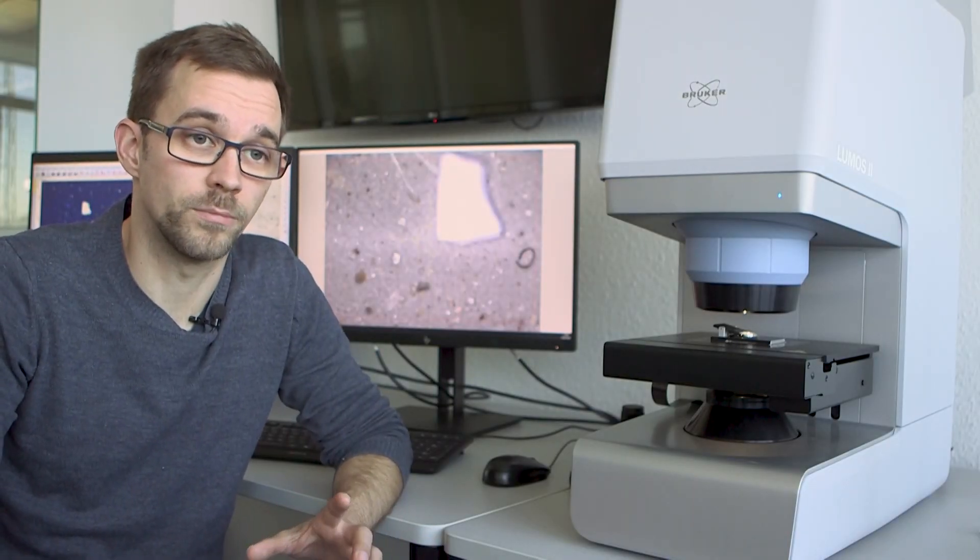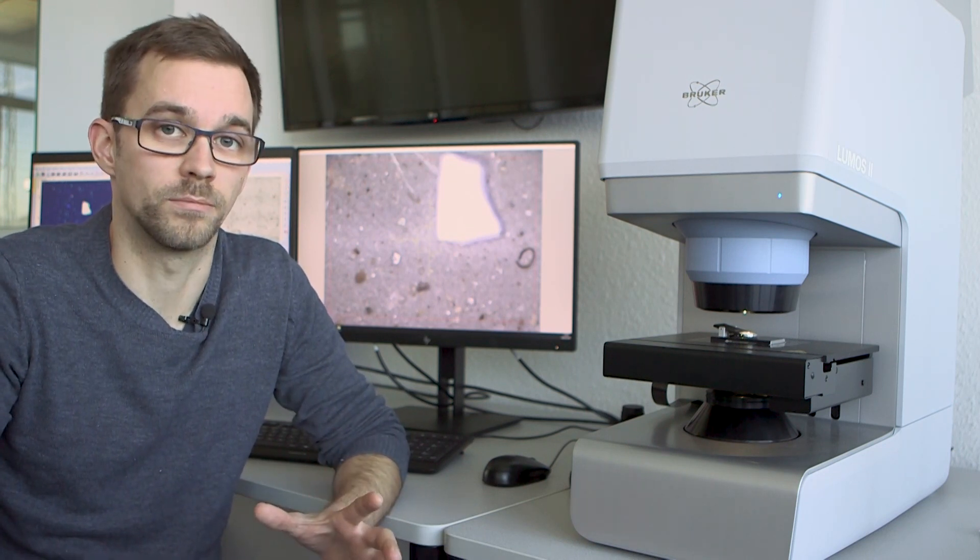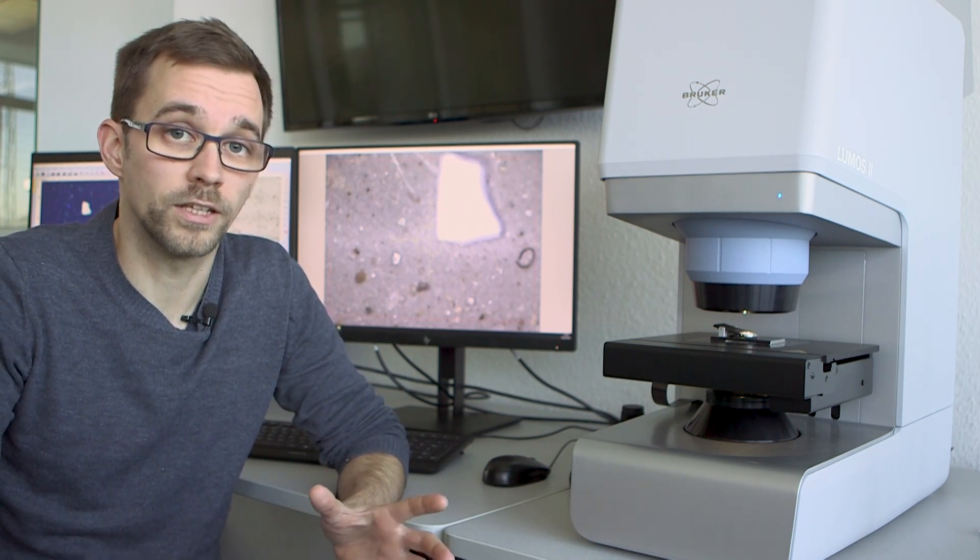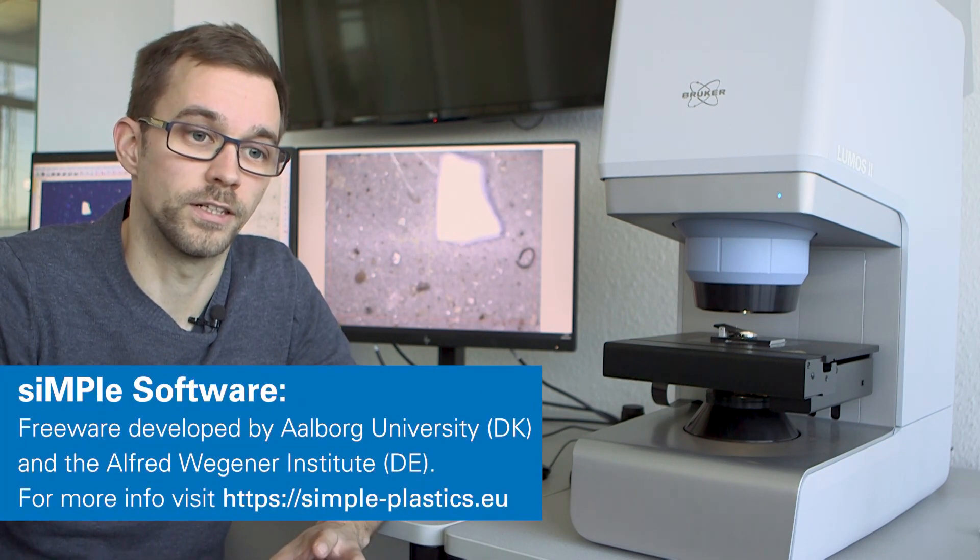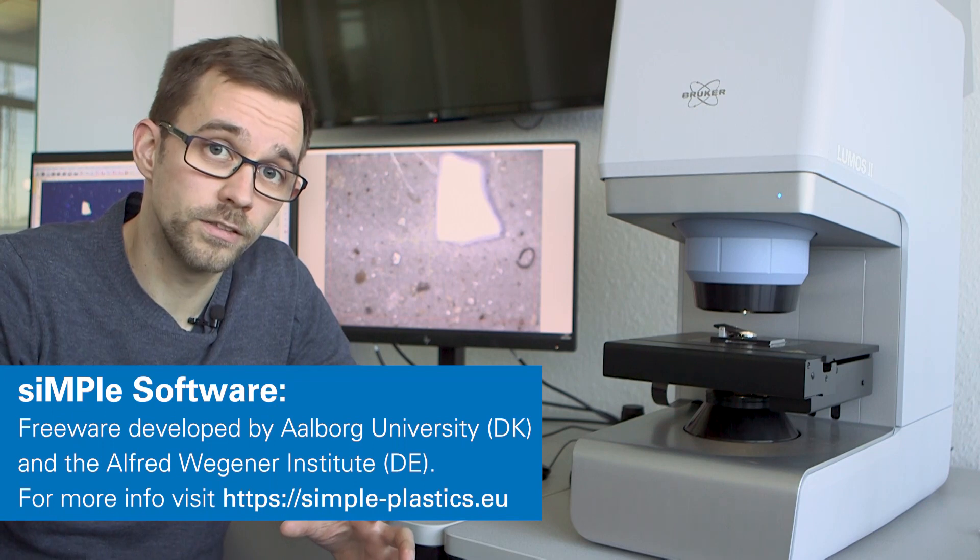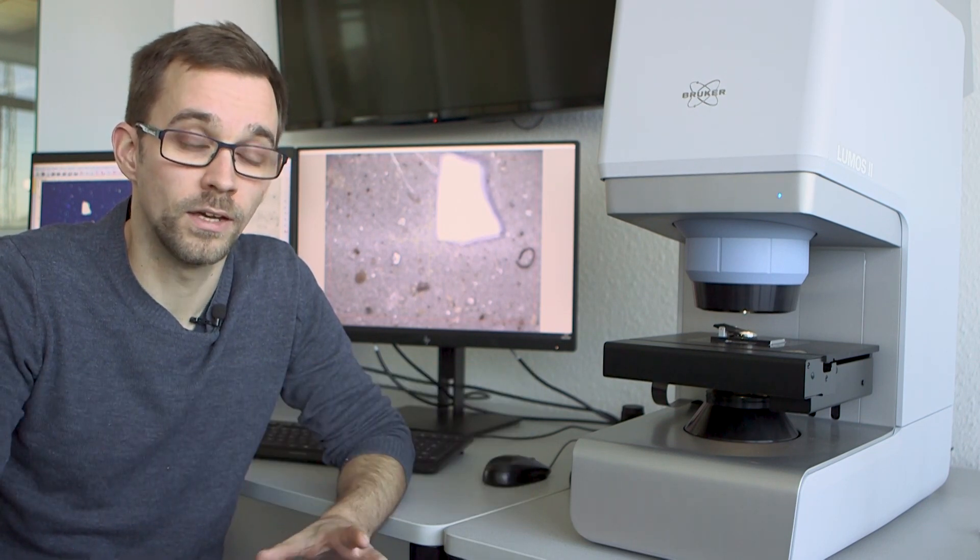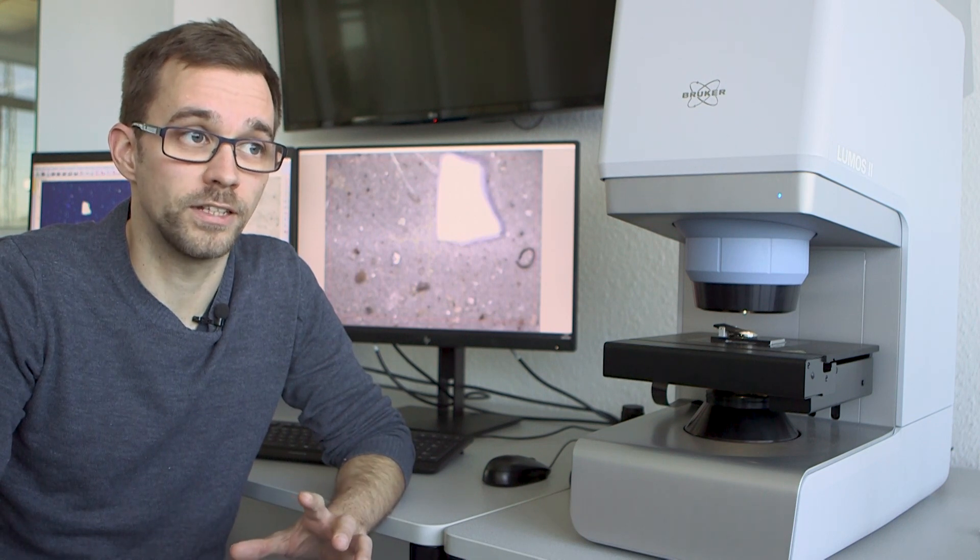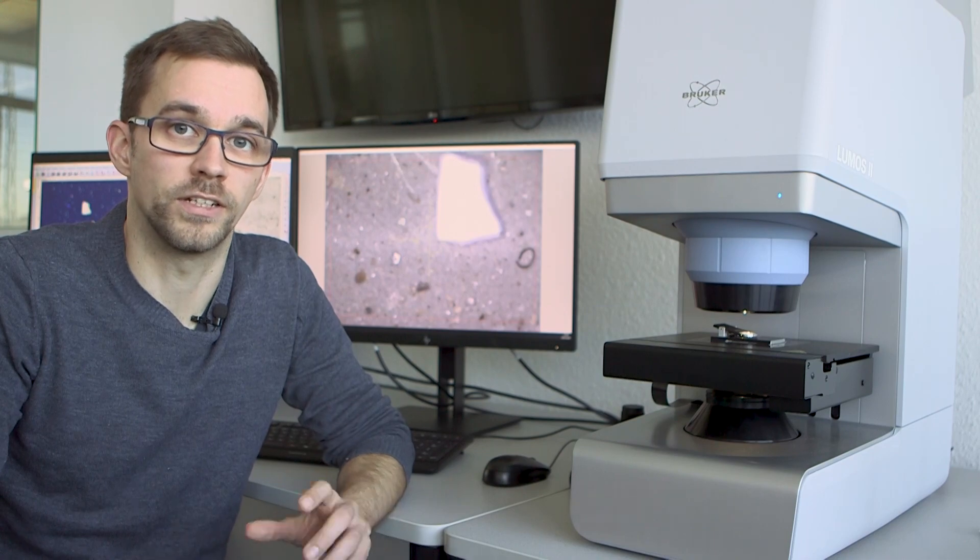Now we have seen how easy it is to identify particles, but if we are doing this for the whole filter, this really may take some time. This is why we are exporting the data to a software called Simple, which is promoted by the Alfred Wegener Institute. The Alfred Wegener Institute is one of the leading expert institutions in microplastics in Germany. And the software is designed to identify microplastic particles based on large FTIR imaging data sets.